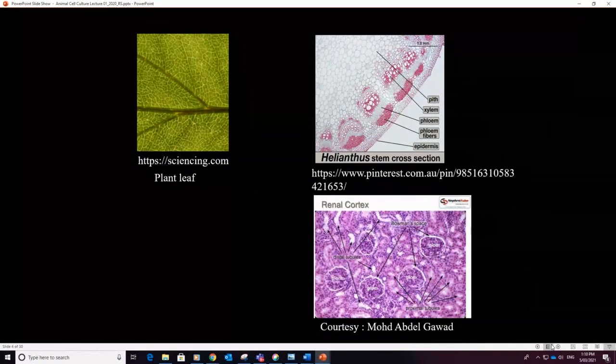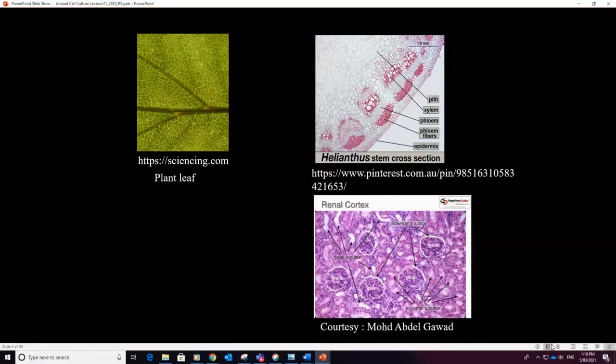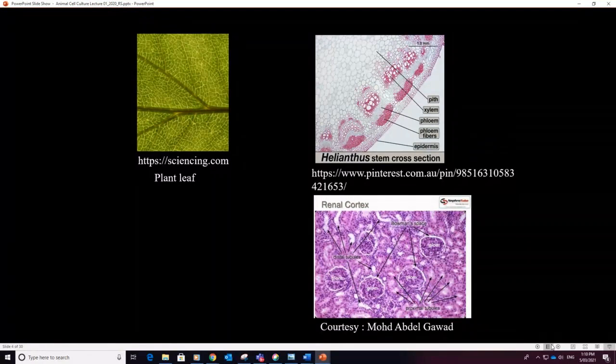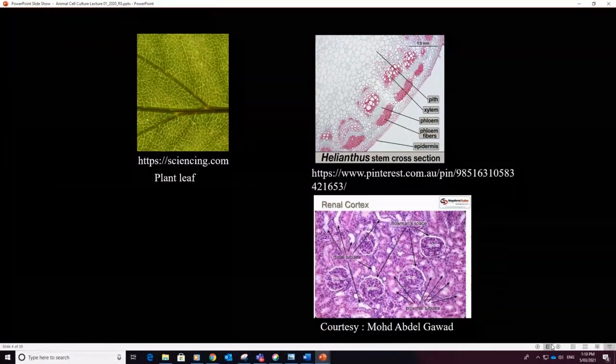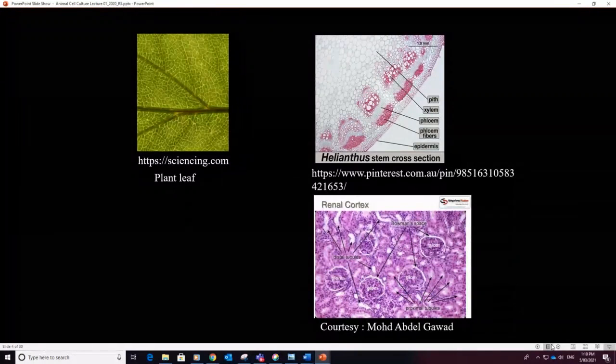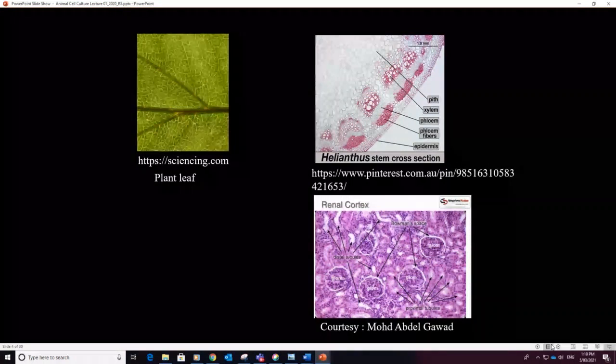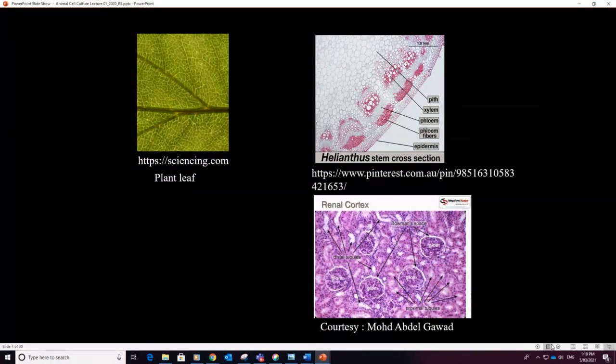So it becomes very difficult for you to interpret whether it's a plant cell or plant part or animal cells, because I have intentionally not put a marker scale. The reason here is just to make a general point. Whenever you are putting your data, if you are measuring using microscopic images, make sure you put markers in there and then tell what you observe.